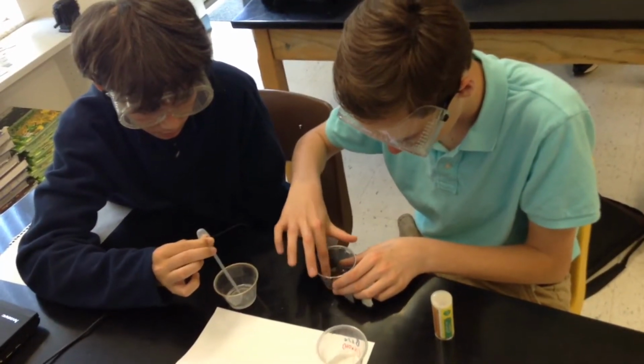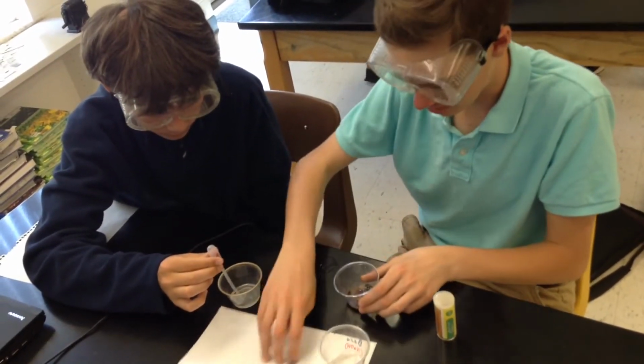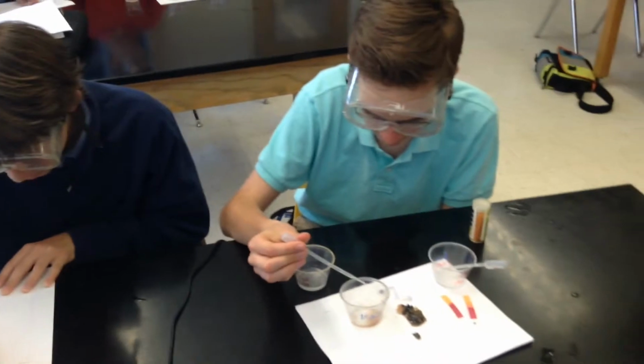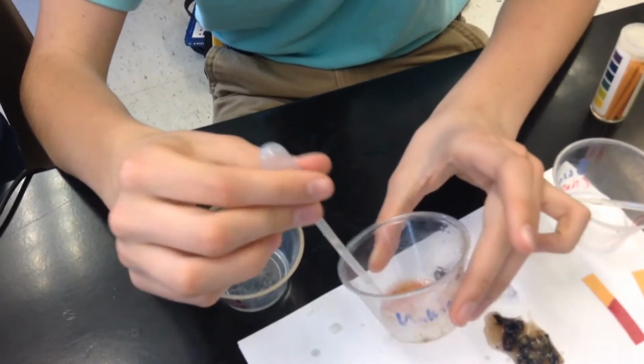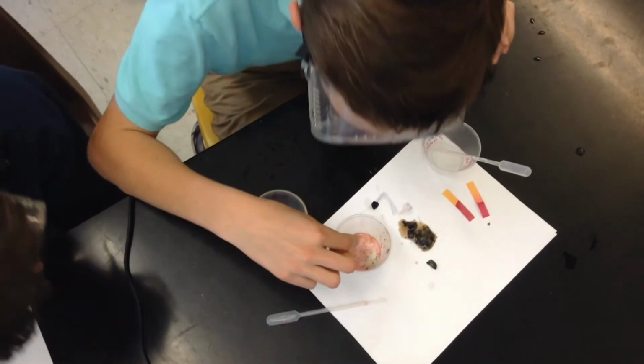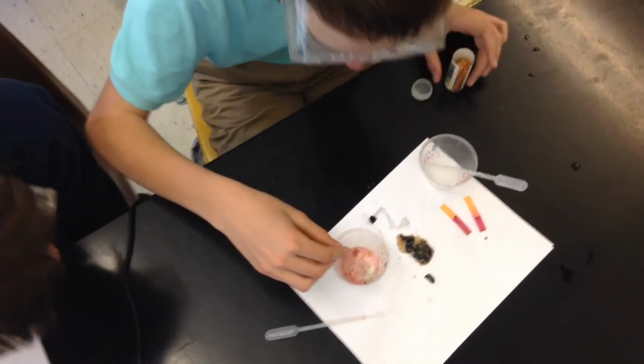So in this activity, a student would take a sample of a material, say one blueberry, they'd crush that blueberry with a very small amount of water, and then they would pick an acid or a base, either works, and add that material, that acid for example, until they got a color change. Then they would use pH strips to determine the actual pH of the color change. Then they go back the other way.